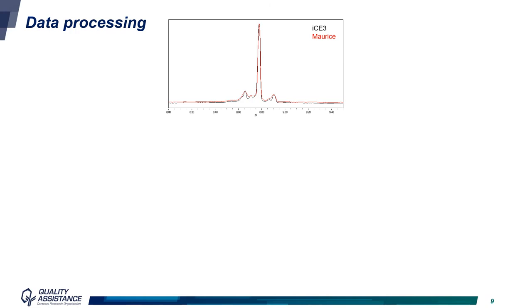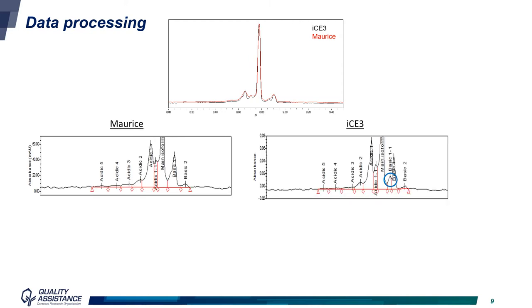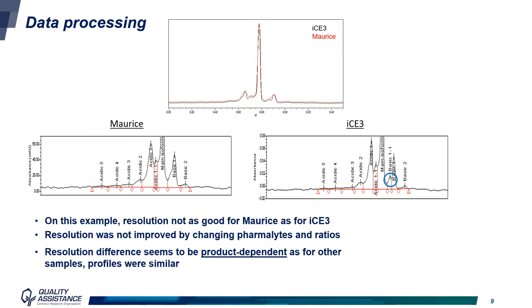As a first approach, electrophorograms obtained on both systems were compared. In this example, the black line represents the signal of I3 and the red line the data for MORRIS. Electrophorograms are overall comparable. Only in the basic region, there seems to be — for this example — a bit less resolution between two peaks, as you can see with the blue circle on the right. We tried to improve the resolution between these peaks on MORRIS by changing ampholytes and their ratios, but we were not able to reach the same resolution as seen on I3.